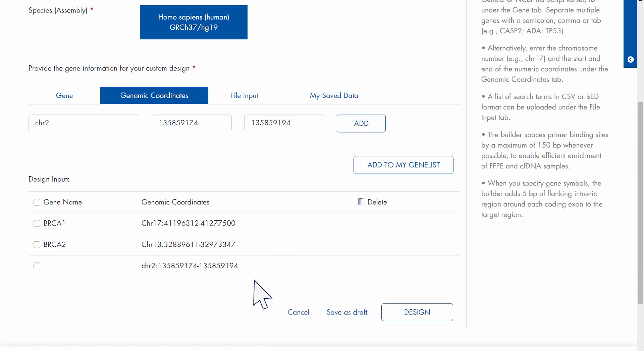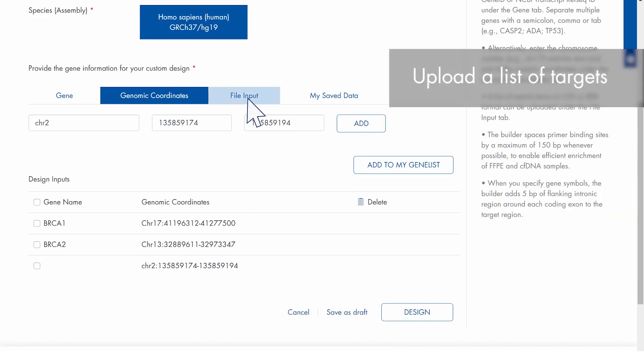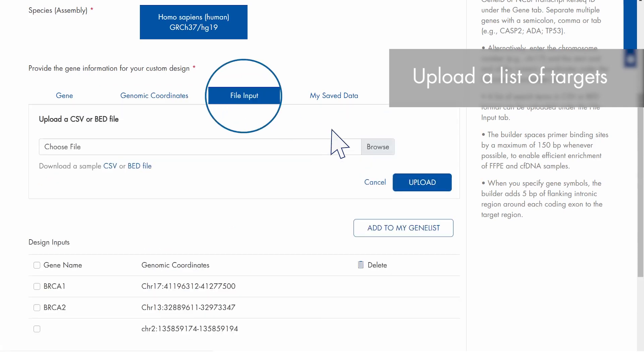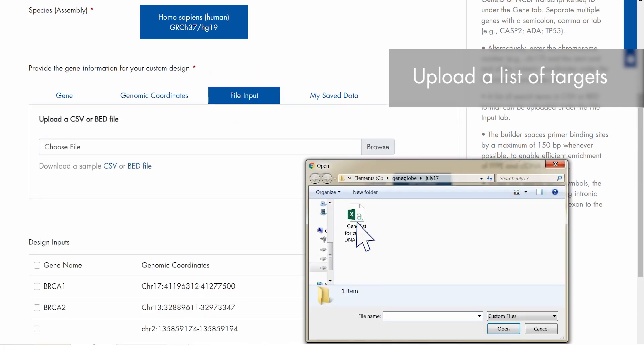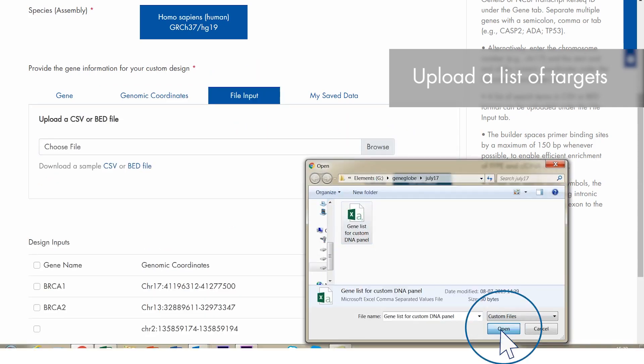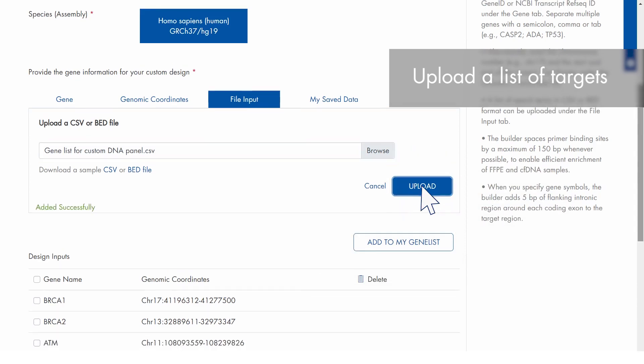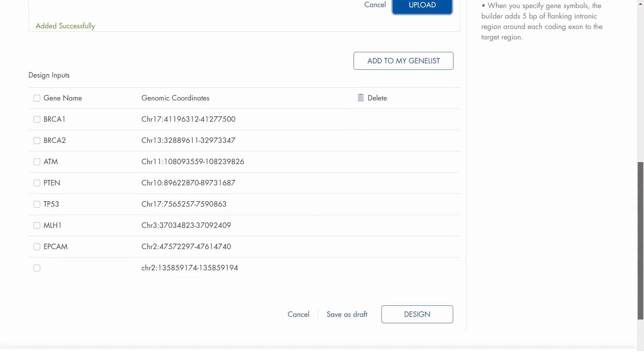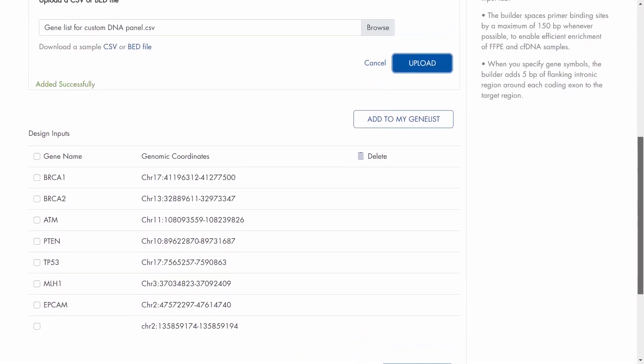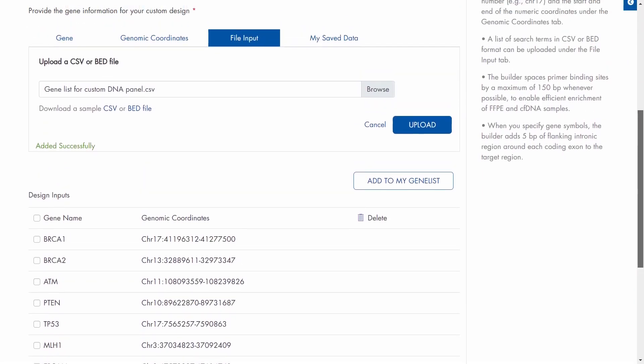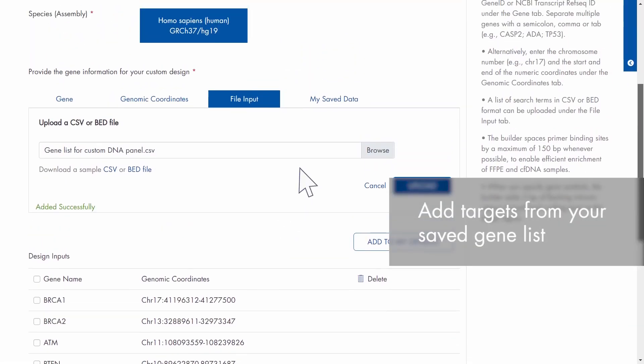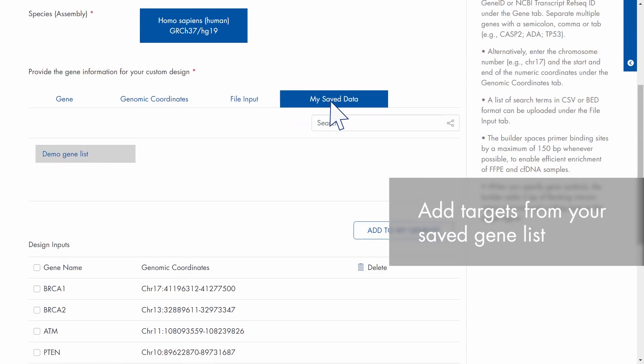You can also upload a list of targets by clicking File Input, browsing to your file and uploading. Or add targets from your personal pathway or gene list by clicking My Saved Data and selecting the relevant gene list.